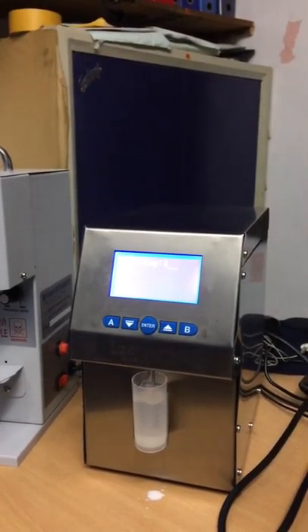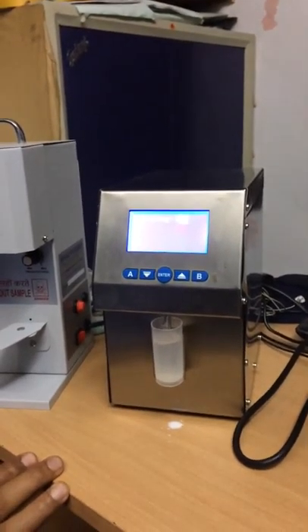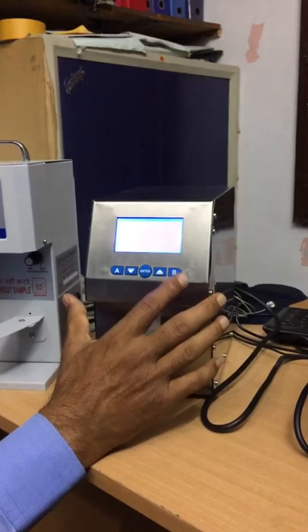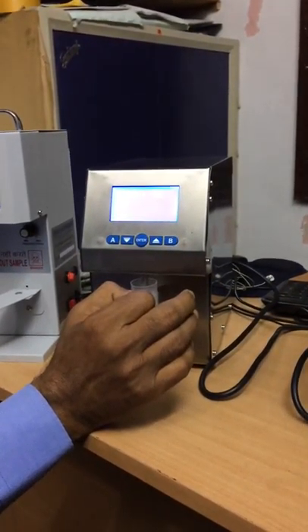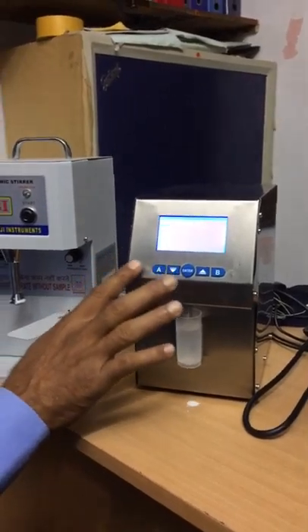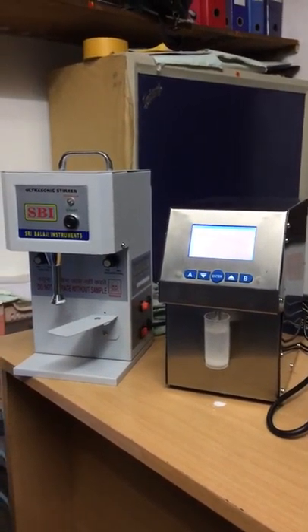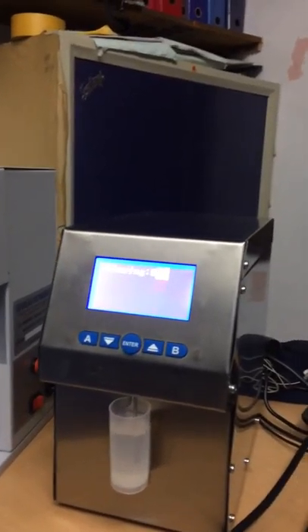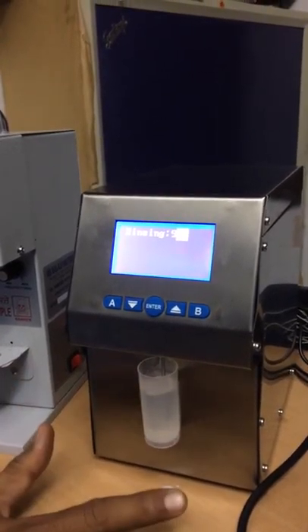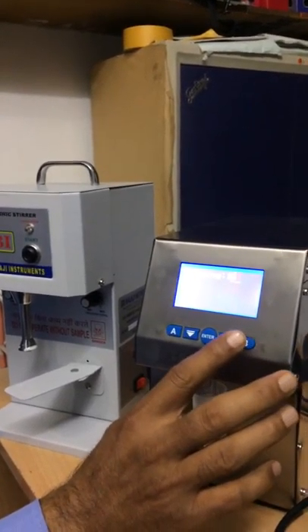This is the cleaning procedure — please watch carefully. When you finish all your work, you have to run 5 water cycles, meaning press B 5 times with fresh water. Next, take the cleaning solution supplied with the machine and run 5 solution cycles. After the solution cycles are done, again give 5 water cycles. Only the B button has the cleaning functionality — it is very easy.